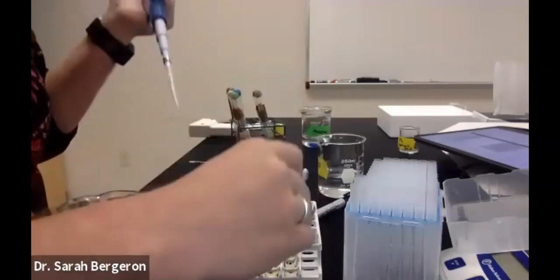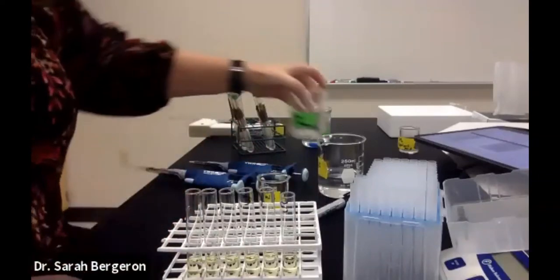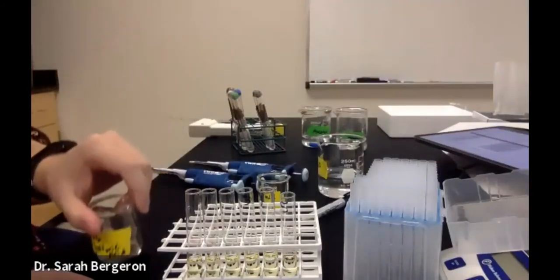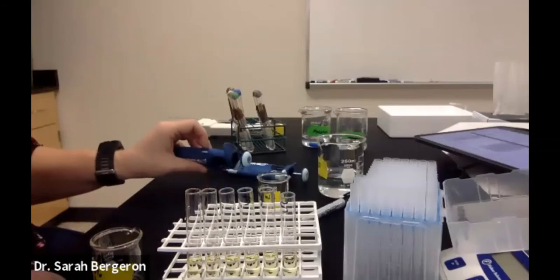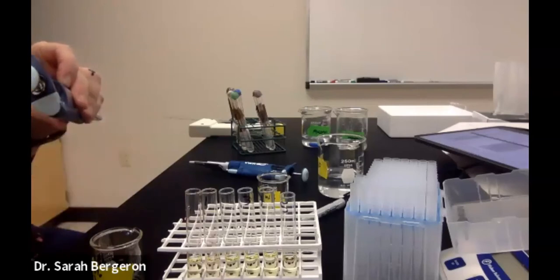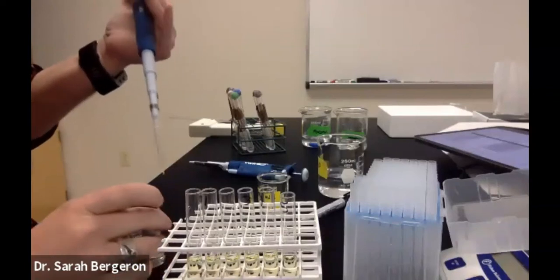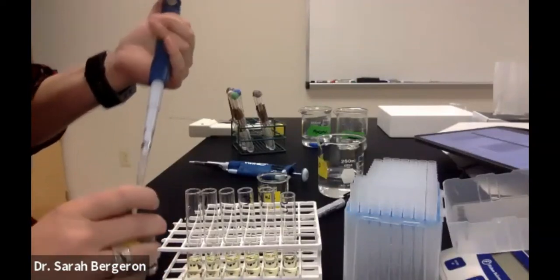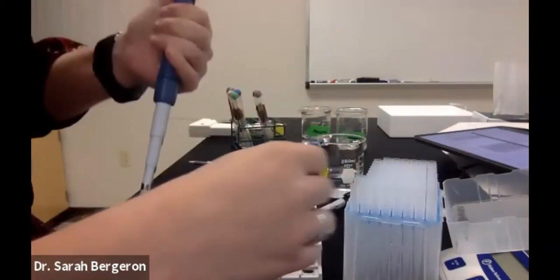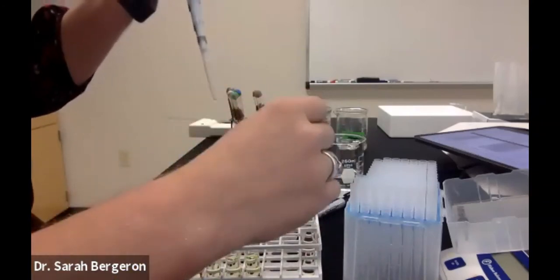There we go. Now, I also need to add my perchloric acid. This is what you added to your samples when you were digesting the phosphate heads off, right? 0.65 milliliters. Okay, so I have two.